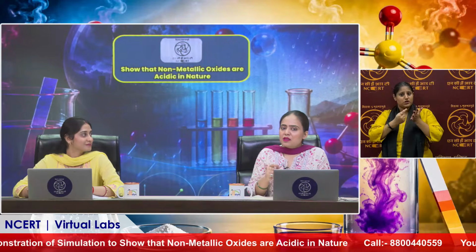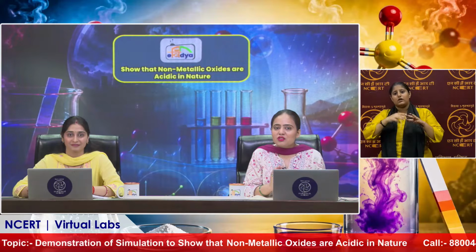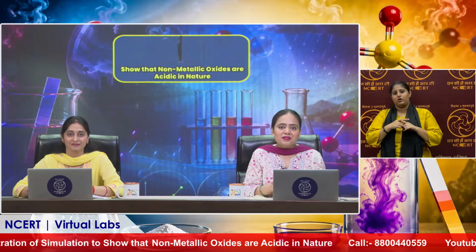And ma'am, can we perform these experiments in the real physical laboratories with the same accuracy and precision after getting prepared, after performing the simulation in virtual labs? As you have mentioned, learning by doing. Yes, correct. When you perform in the virtual lab, then you will perform in the real labs. So obviously it will be much easier for them and they will perform it with more accuracy and more speedily. So you'll save time and of course in examinations you will perform well. If you have any problem in any concept, learn it through virtual lab, apply that knowledge, and you can definitely score well in the examination. Learning is going to be joyful now and not at all a burdensome task for you.